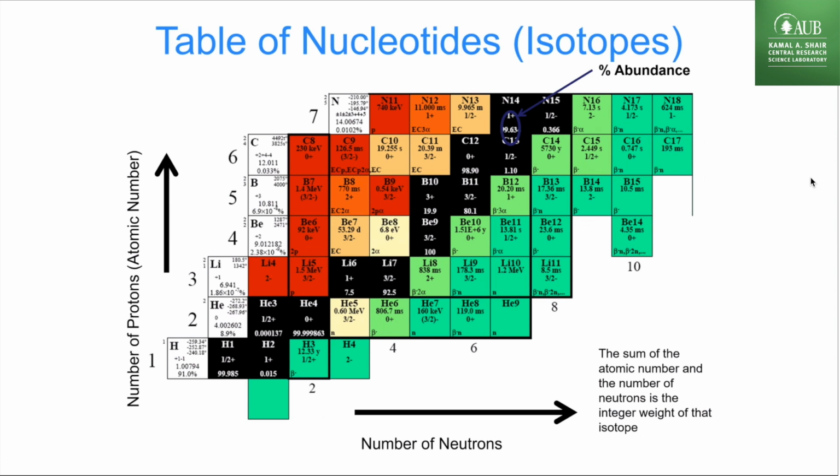And then it's going to be a little bit more than 1 Dalton mass difference. So this is a very important concept in high-resolution mass spectrometry, to understand these isotopes, the stable ones in the black, and which elements have isotopes which contribute.